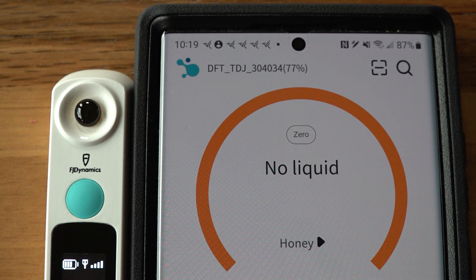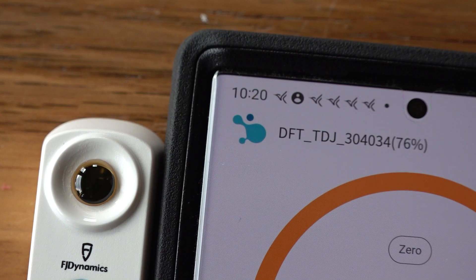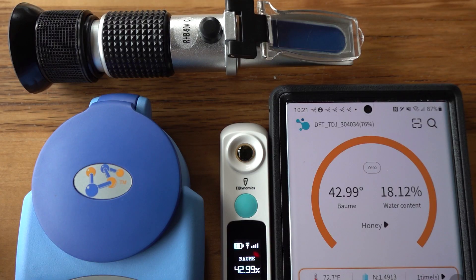This is the honey phase again. The green light comes on showing it's registering, and we're at 18.12% water content. With all parameters the same — same temperature, same unit, same honey, same calibration method — we have spanned from 22% water content all the way down to 18% and change. So it's kind of all over the chart.